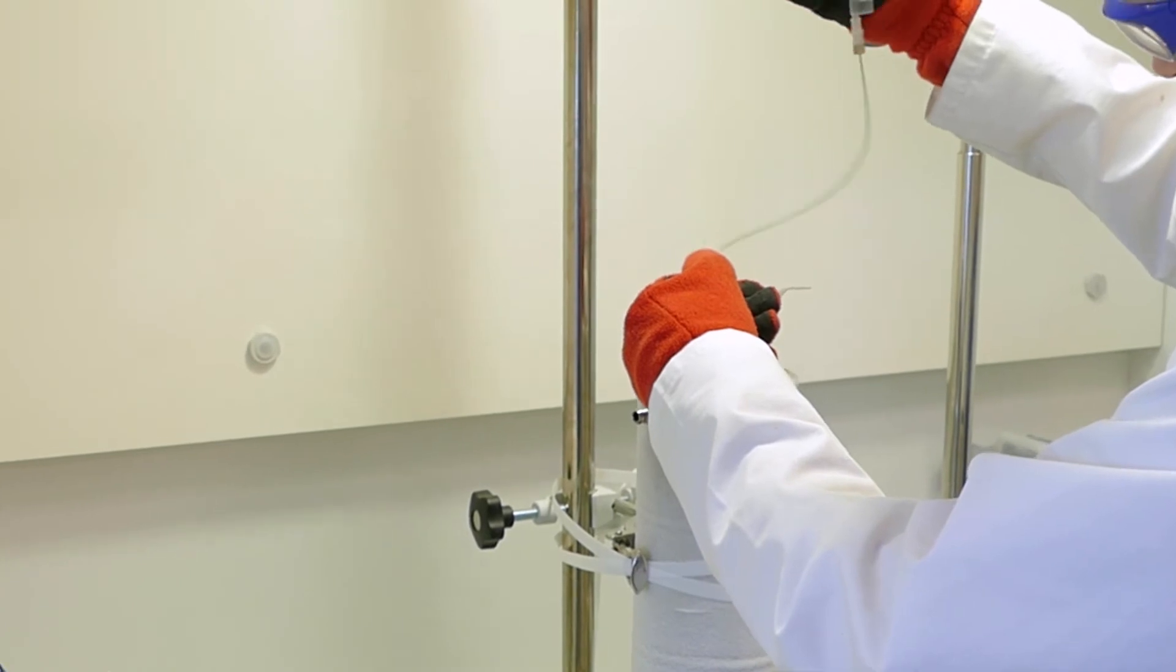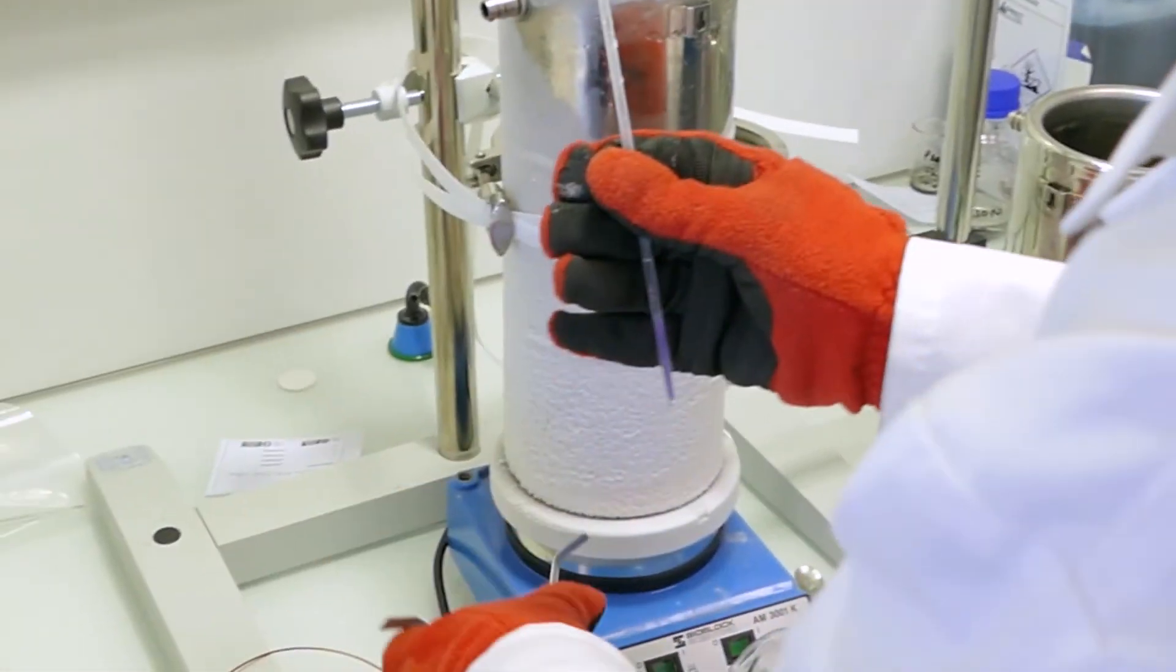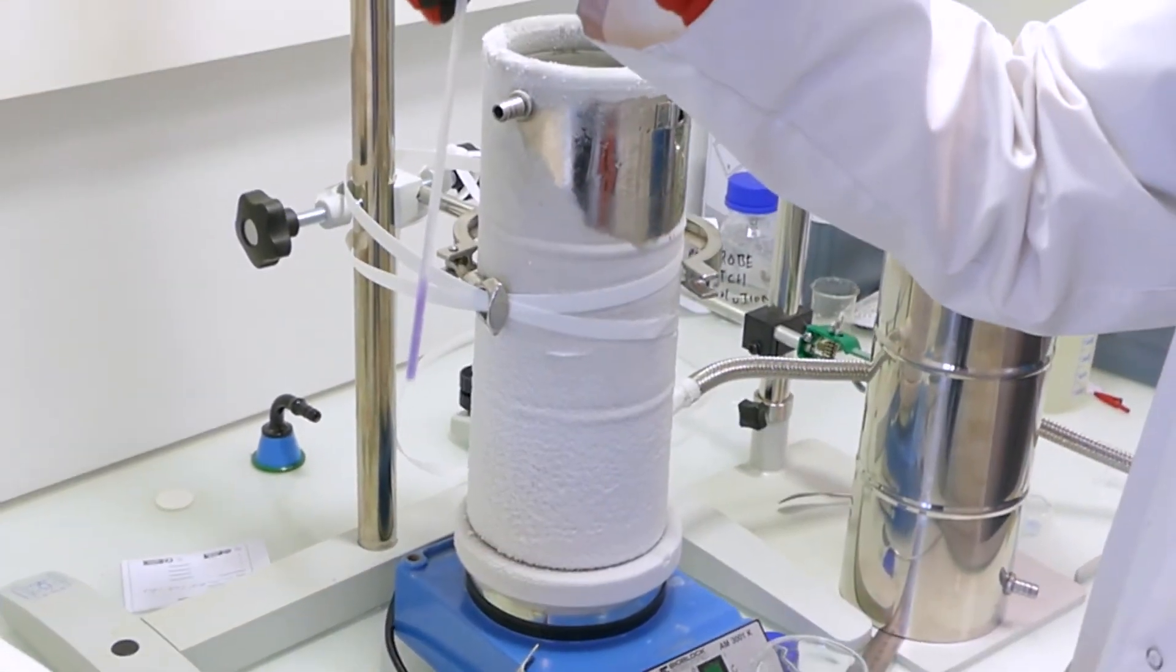Pull the remaining isopentane from the EPR tube. Remove the EPR tube from the funnel accessory. It can now be stored in liquid nitrogen for future analysis.